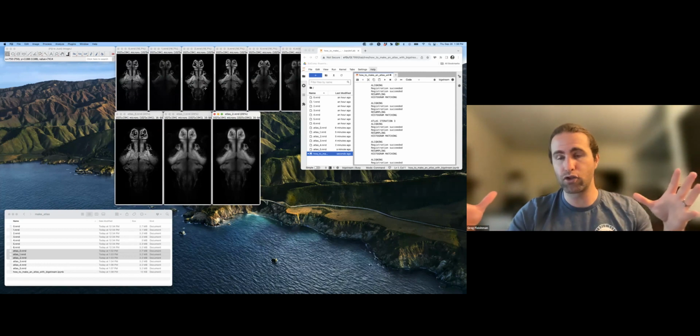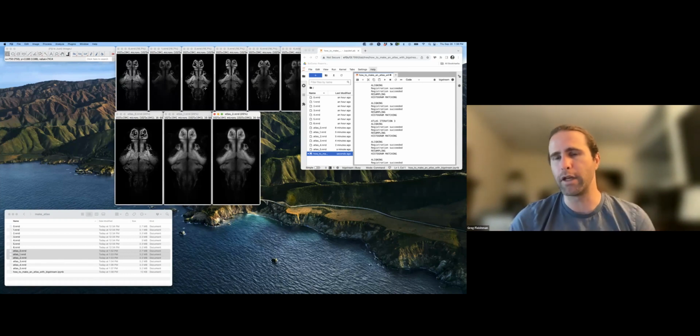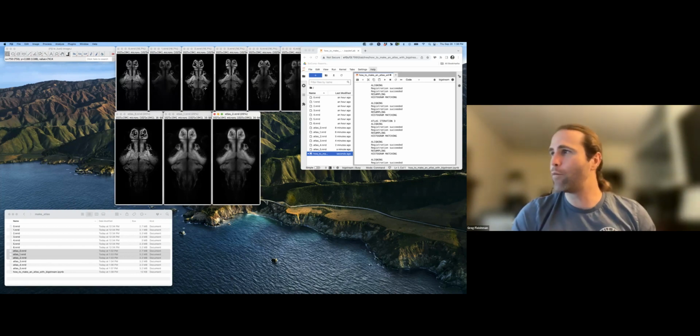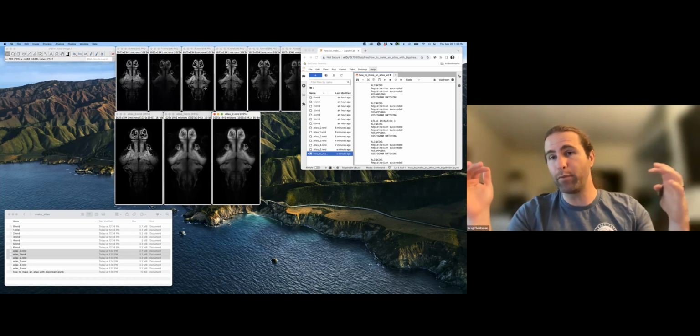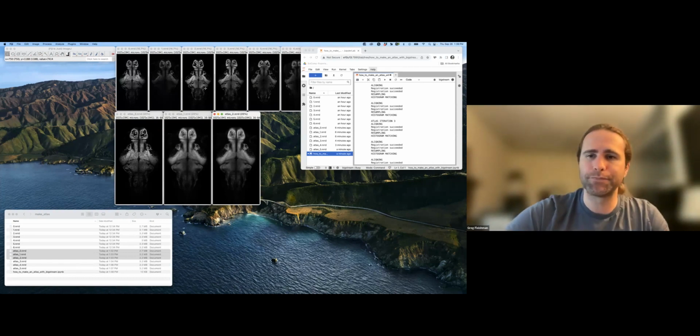You're trying to register multiple copies of the same structures and average them together to produce something that is representative of the population. And as long as you feel that you can do that with the things that are resolved in your image, the things that are stained in your image, then yeah, different numbers of planes is totally fine. When all of the individuals get resampled in order to match the atlas, everything is on the same voxel grid. Everything will get upsampled so that you'll have the same number of planes at that point, for all samples.